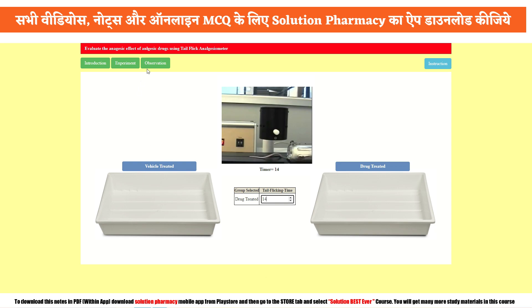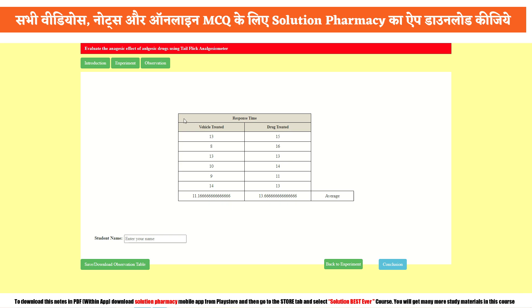Click on the observation tab to review results. The average response time for the vehicle treated group is 11.16 seconds, whereas the average for the drug treated group is approximately 13.66 seconds, roughly 14 seconds. This increase in response time in the drug treated group indicates an increase in pain threshold after giving the analgesic drug, proving that the given drug has analgesic activity.